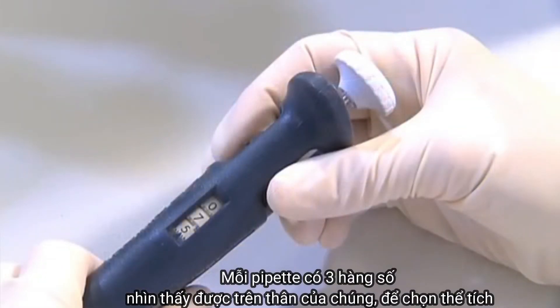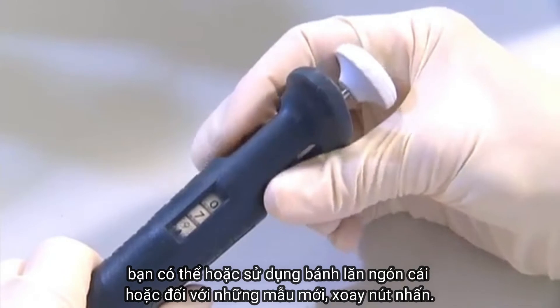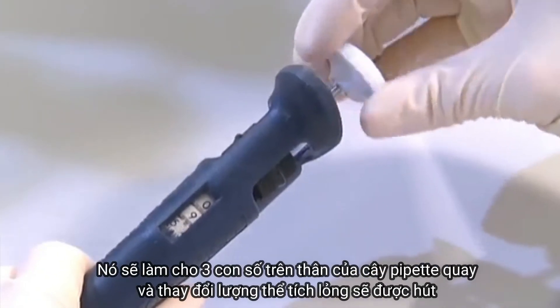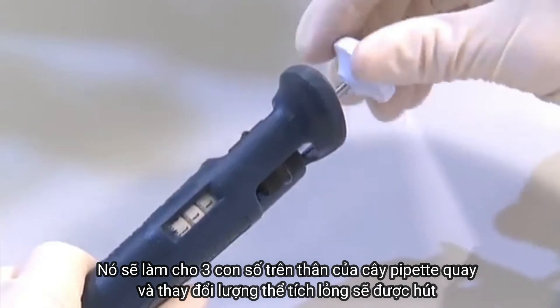Each pipette has a vertical row of three numbers visible in the body of the instrument. To set the volume you can use either the thumb wheel or, on newer models, the push button. This will cause the three number dials in the body of the pipette to rotate and change the volume of liquid that will be taken up.